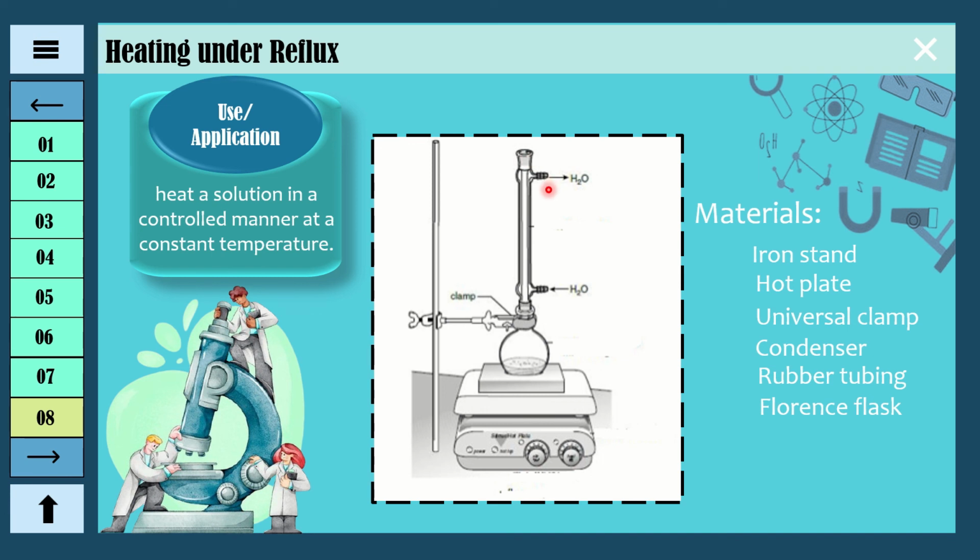Heat and boil the round bottom flask using the hot plate. There are a couple of things we need to understand in this technique. First, you bring the temperature to a high value, just to get the solvent boiling.